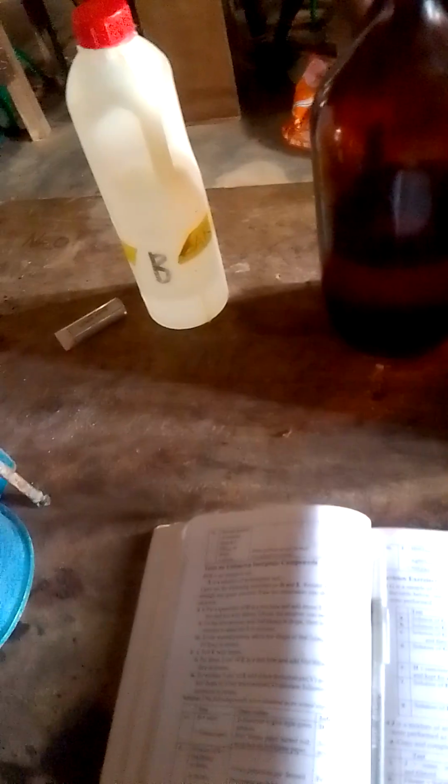At the observation, what we saw here is that D dissolved in water to give light green solution.